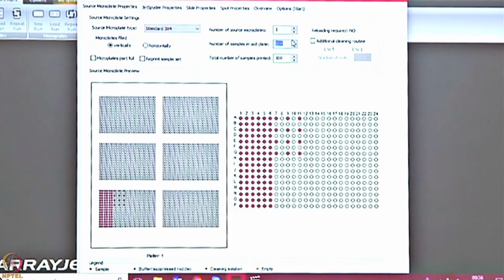And that's how you can fill the plate. It tells you exactly where you want to put your sample. Everything is automated. You design your run and the software will tell you how to prepare your sample plate. It will give you a printout that, if you want to print 22 samples, shows where your 22 samples will go so that your experiment looks how you want it to look. The software will tell you exactly how to design all that.